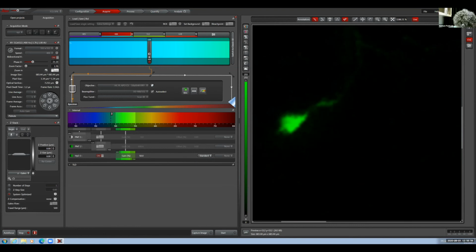Although to be honest, this is so fast so far, I don't know if I'm going to care about the speed so much. Right. I mean, if you're going to high formats and multiple colors and things, it can actually slow down.